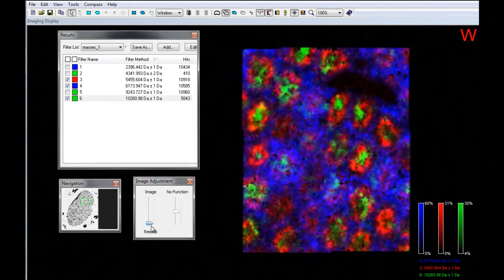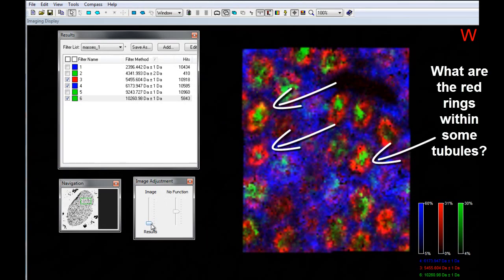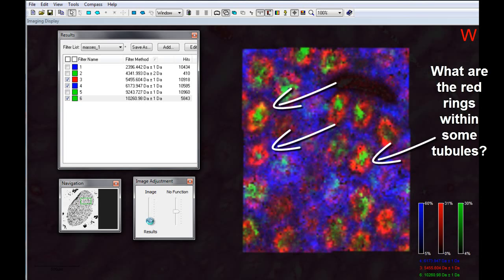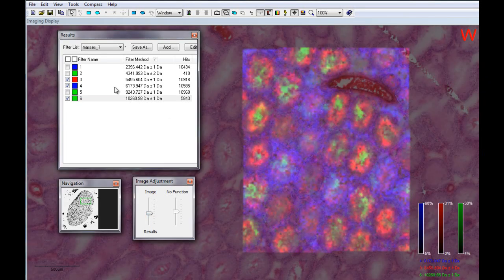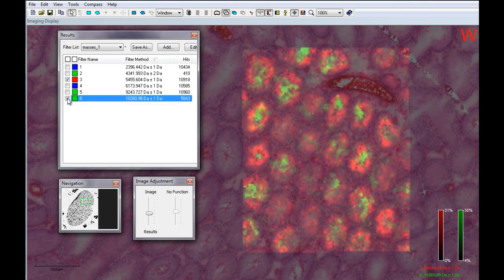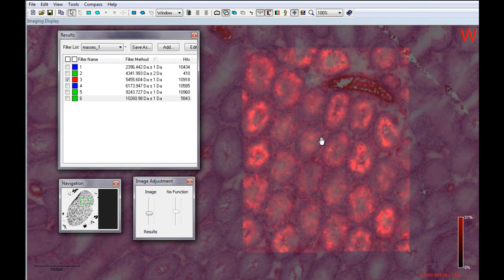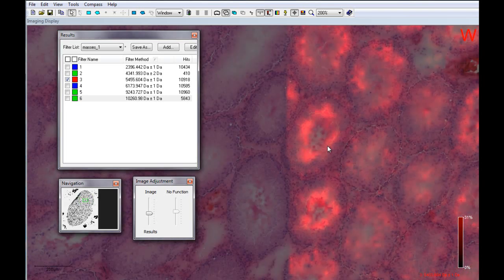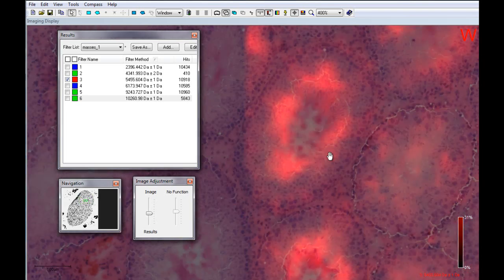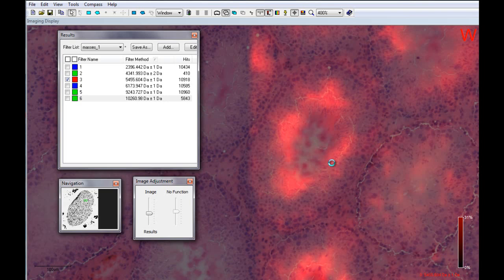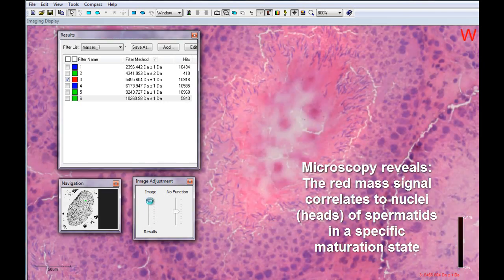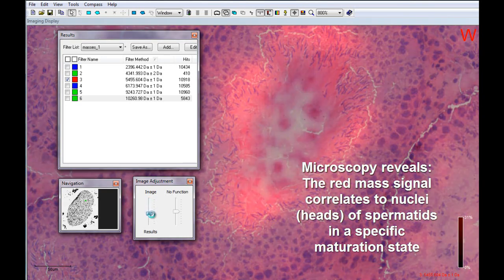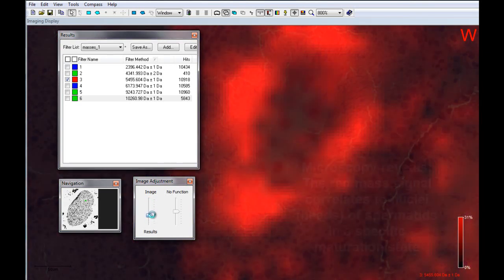As we map the presence of various mass signals across the tissue, we find that in some tubules we observe a ring resulting from one of the mass signals. Seamless fading to the microscopic image shows, once again, that the presence of this ring can be correlated with the anatomy. Zooming in on the fine detail of the tissue shows that this red mass signal correlates to the nuclei or heads of the spermatids in a specific state of maturation.